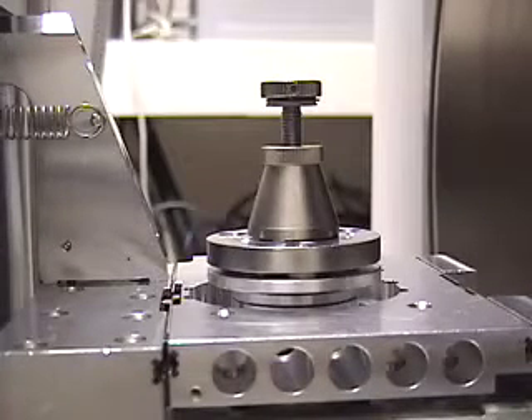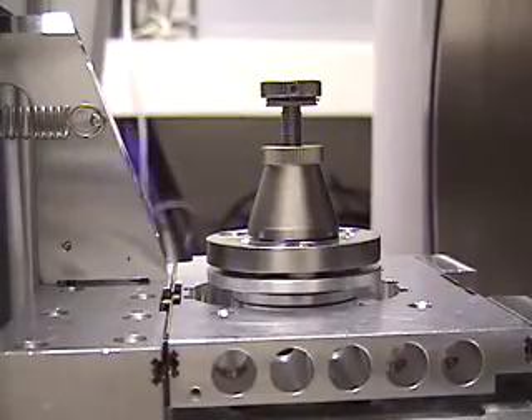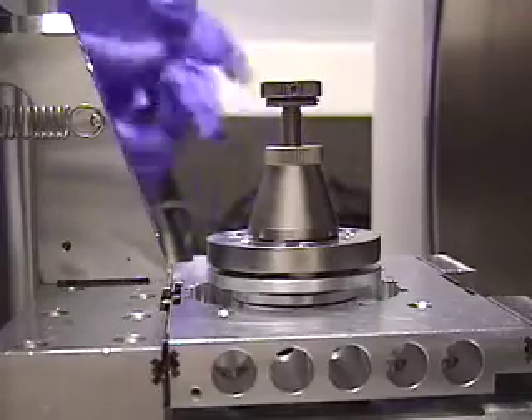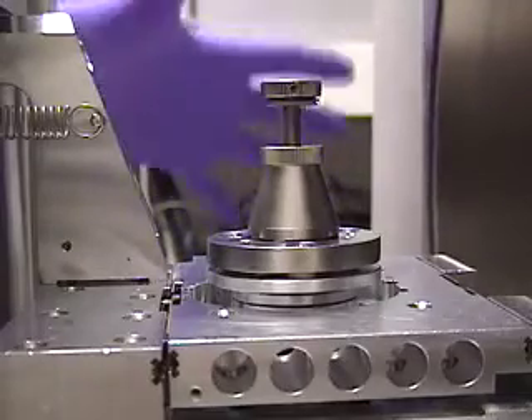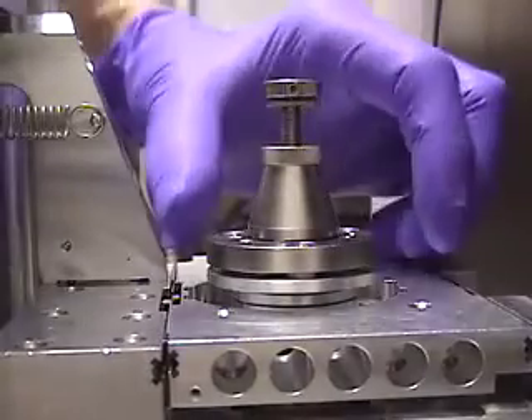The interior of the sample chamber must be kept clean at all times. This is why the equipment is held under vacuum, even when not in use. Gloves are worn to prevent the transfer of skin oils and greases to the inside surfaces.